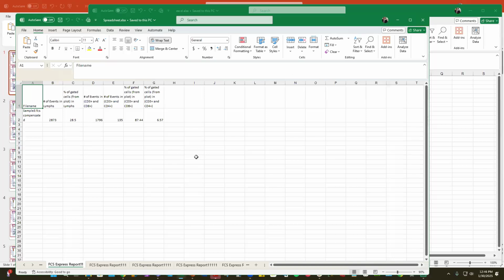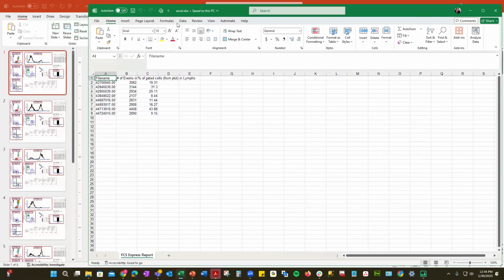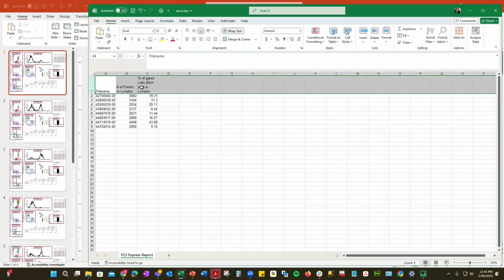So if you had a huge amount of statistics on something and you just wanted to work on each of the spreadsheets that you created, and any of the formulas, that would all be here. Or we had the last spreadsheet that we created, which is where we wanted them all together. So now I can select this, I can wrap the text, and I have all that statistics there.